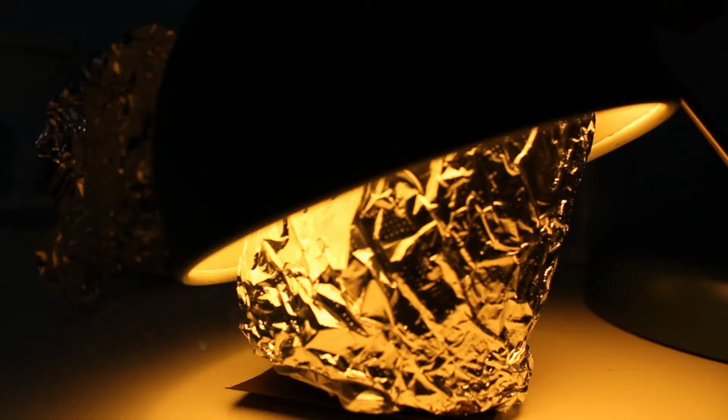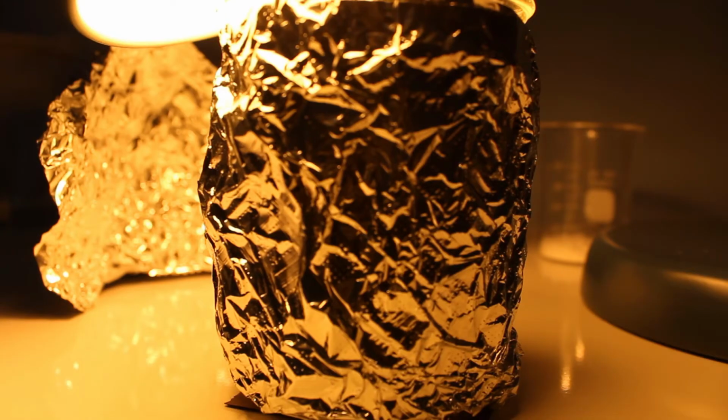Well, finally the popping noises have stopped, and that means that my salts are dry now. So let's get them out. I think I messed up. It's making crackling noises. I'm afraid the glass might be cracking. I hope not, but that might be the case.